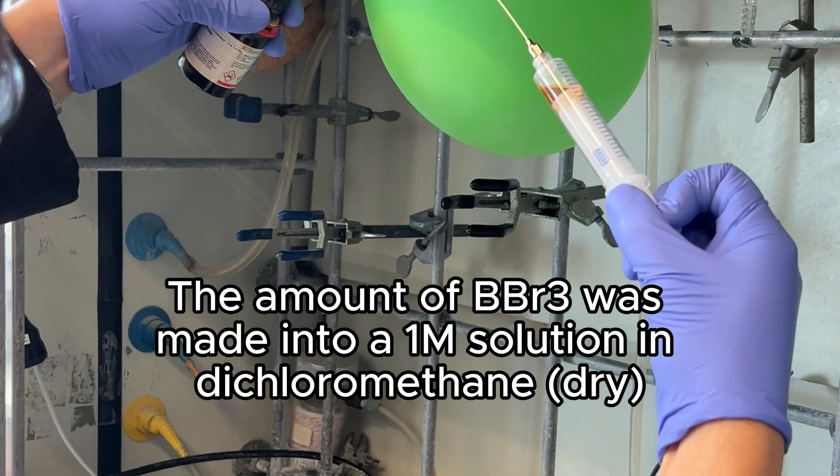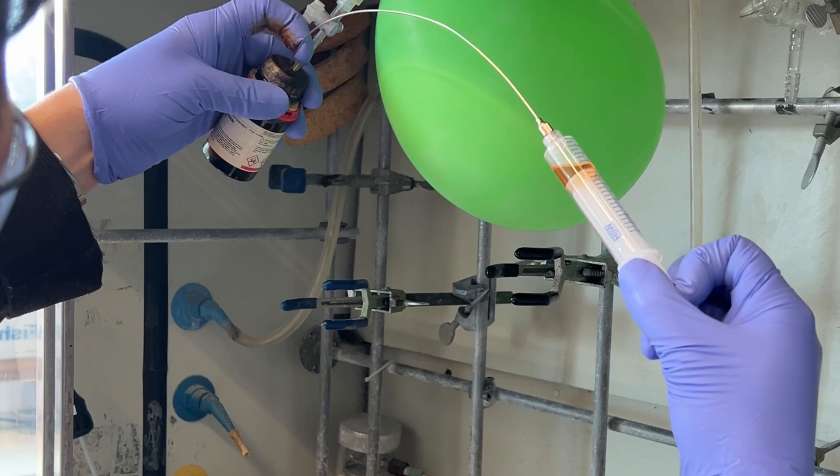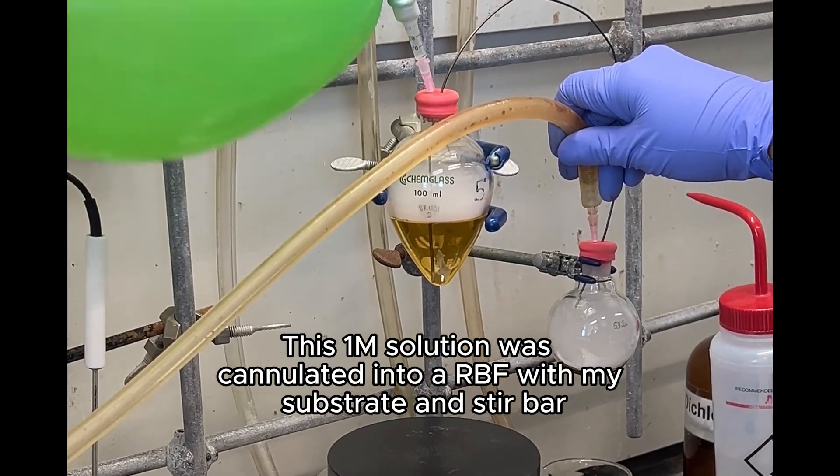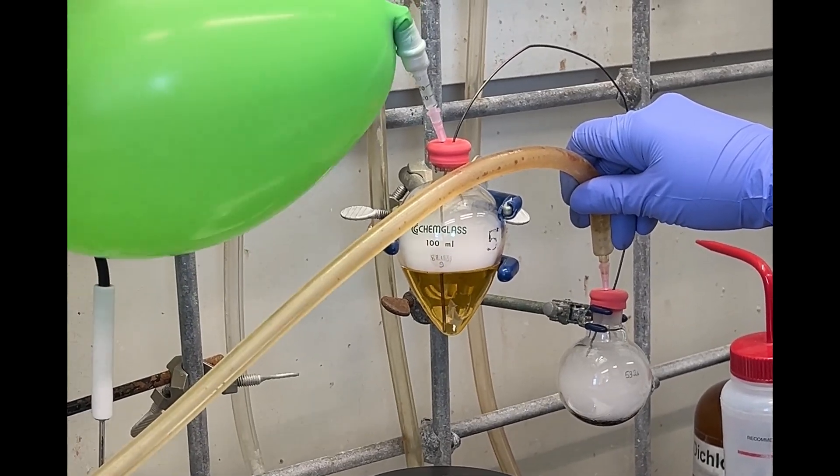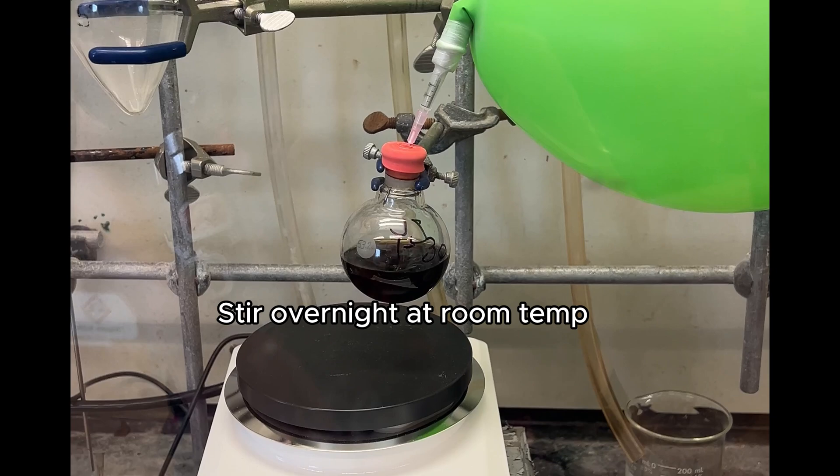I was able to take this amount of BBR3 to make a one molar solution in dry dichloromethane. This one molar solution was cannulated into a round bottom that was also dry and purged with argon, containing my substrate and a stir bar. The reaction went overnight at room temperature.